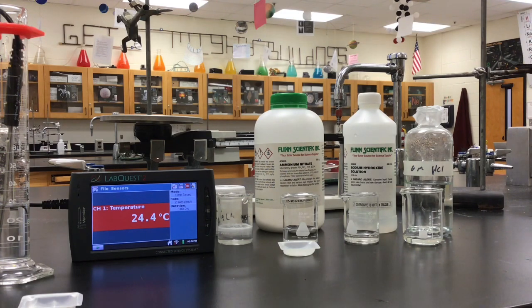Let's think about what that means as far as exo or endothermic. We put it back into our beaker over here. It's going to come back down to about 24 degrees, which is about room temperature in here right now.